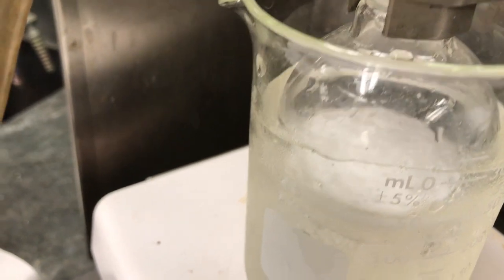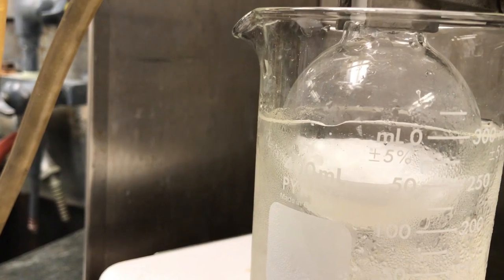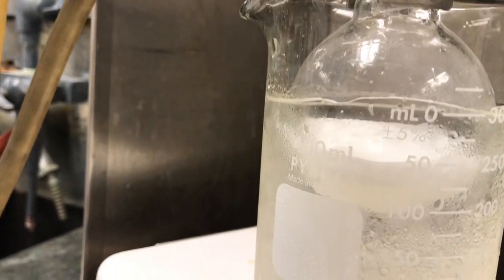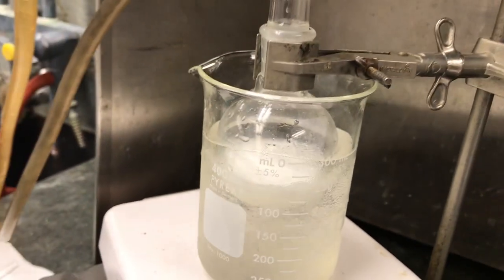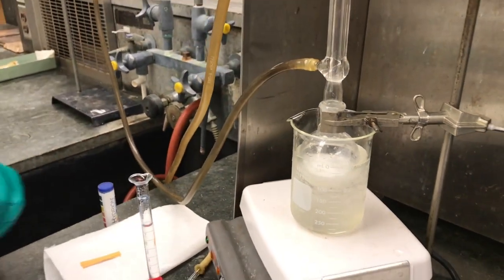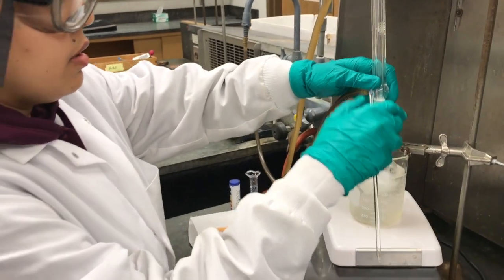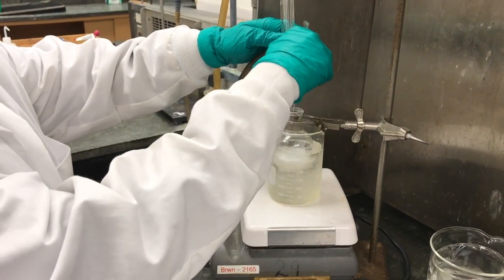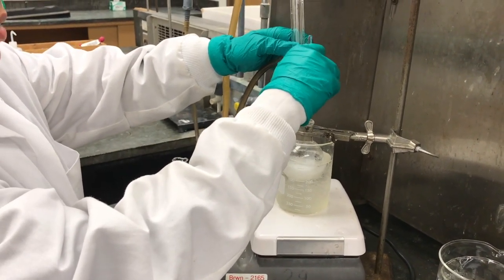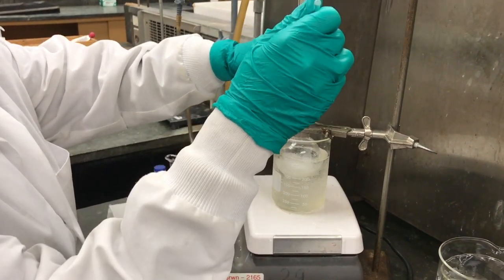You have to be careful with this. You don't want the froth to be so high that it reaches the condenser. You need to stop adding once you see it get vigorous. Now what I'm going to do is check the pH of the solution. The easiest way is to lift the condenser and stir our solution in here. You don't want to check the pH of the foam because that will give you errors. Then put it back in.